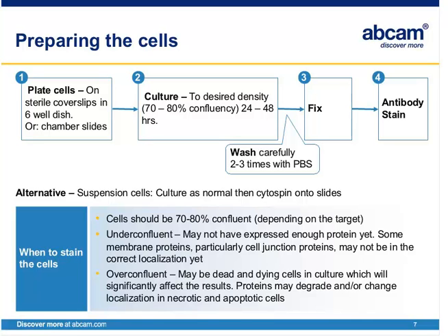When do you know when your cells are ready to stain? Although we say cells should be about 70 to 80% confluent, this very much depends on the target. Some cells need to be really very confluent before they start expressing the protein in the correct localization, so this may need to be optimized. If your cells are under-confluent, they may not have expressed enough protein yet — for example, some membrane proteins and cell junction proteins may not be expressed in the correct localization. If cells are over-confluent, you may have dead and dying cells, which could affect your results, and proteins can degrade and change localization in apoptotic cells.